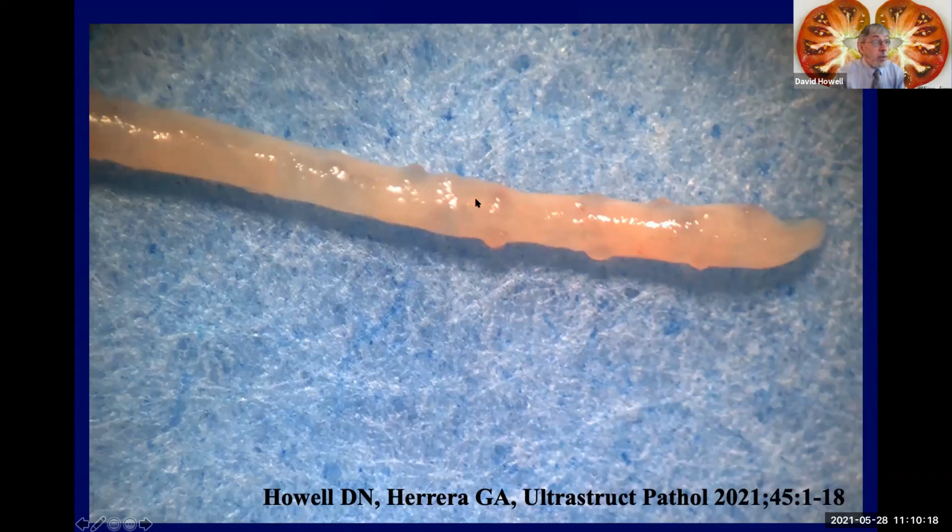This is the cortical portion. Down here, I think we're getting into medulla. And you can actually see glomeruli sort of pooched out on the surface of this biopsy as little domes. And this thing would be about 1 millimeter in diameter, sometimes less if a smaller bore needle is used, and generally about 2 centimeters in length. So it's a very small, scarce, precious resource.